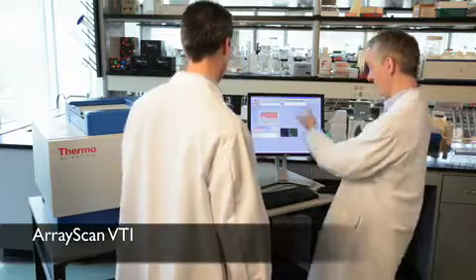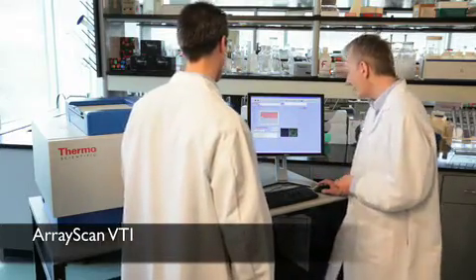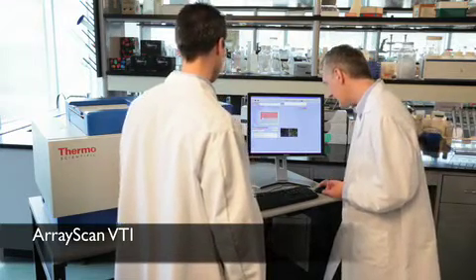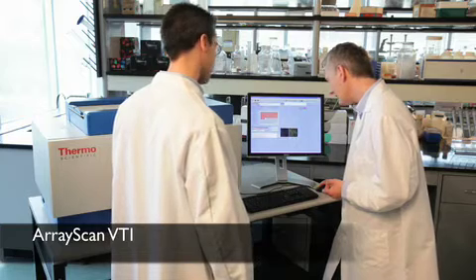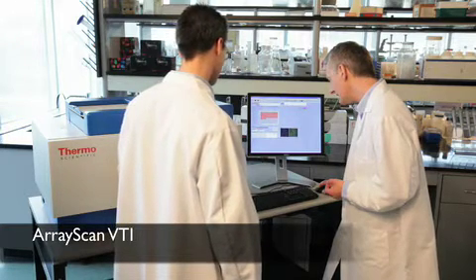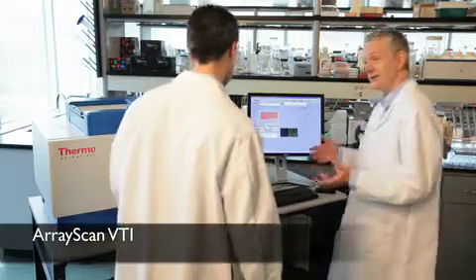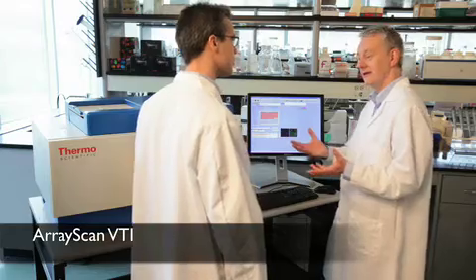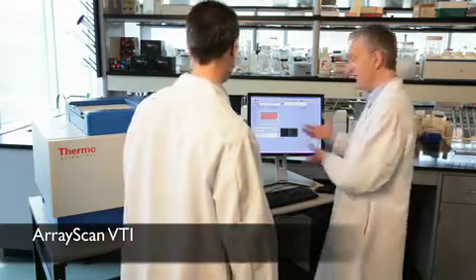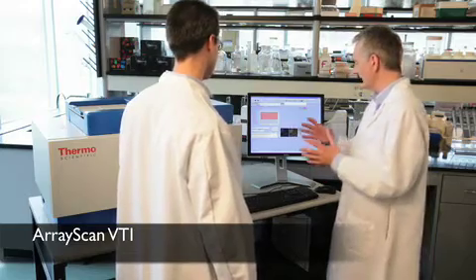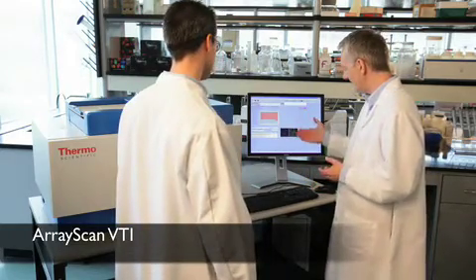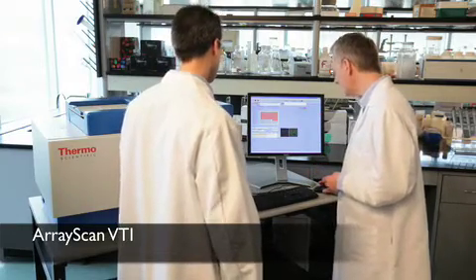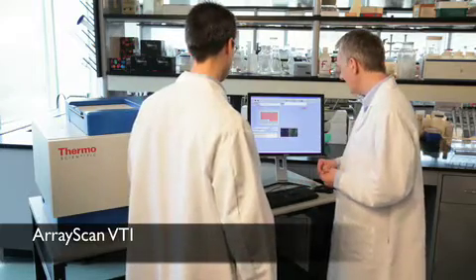It's looking like about three, under four minutes. So yeah, actually, the number of measurements. We're making about 100 different measurements here. Let's take a look at another one of them here. This length-width ratio is pretty neat, actually. The bulge that you have, it's a toxic compound that you told me earlier. That affects the shape of the cell. And that's what this system is really good at. It's good at measuring not just targets in the cell, like you have here, but also the shape of the cell. So that's a really important parameter.